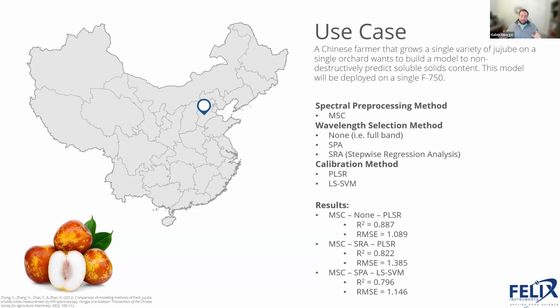Now, this is where I want you to see the bigger picture. When I said at the beginning that the sampling is the most important part, and that this is more like the icing on the cake, something you can experiment with but isn't going to determine the overall quality of the model nearly as much as the sampling and the testing, here's where you can see that evidence. We're talking about differences in the hundredths for most of these statistics.